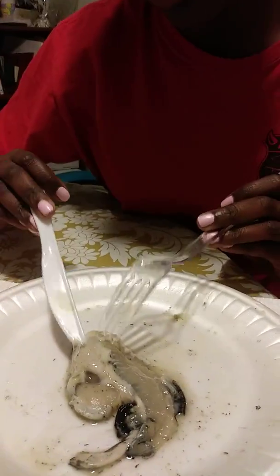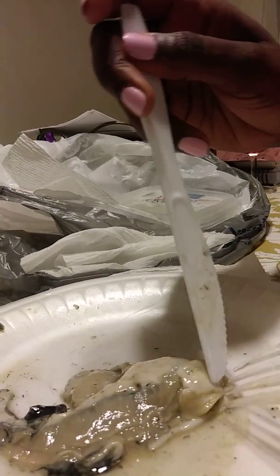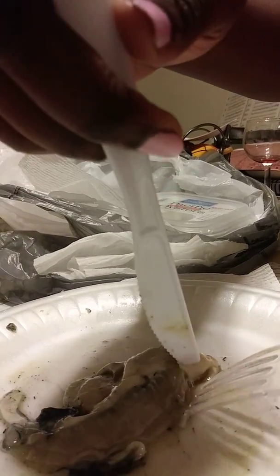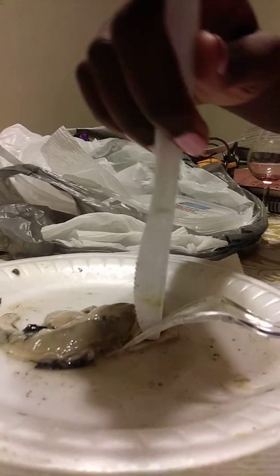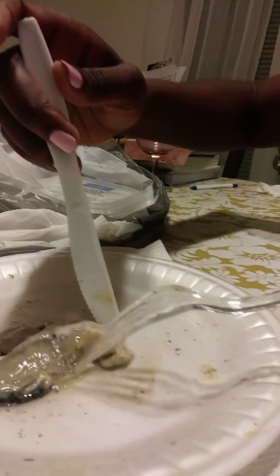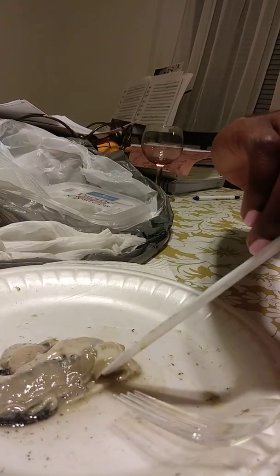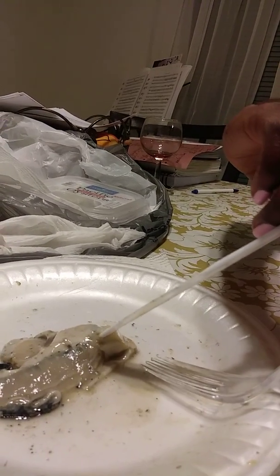This is the oyster's stomach. This is the stomach. And this is the mouth. When we open the mouth, we see the inside. That's how he eats his food. This is his mouth. So if I stick the knife right here, I would be putting it in his mouth. So he's biting the fork. That's his mouth. This is his stomach.